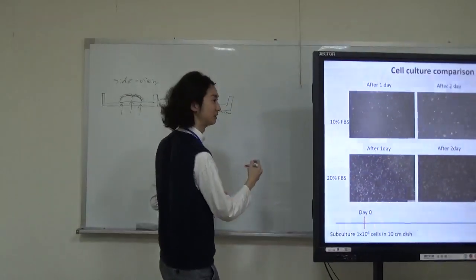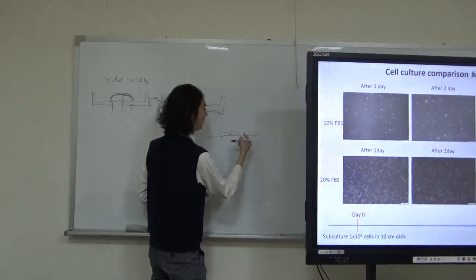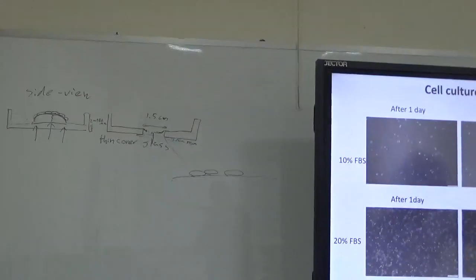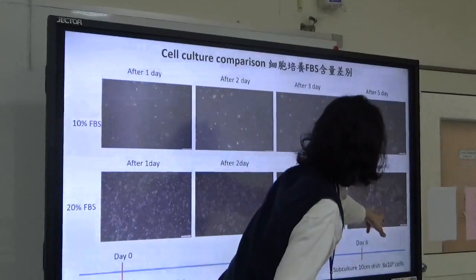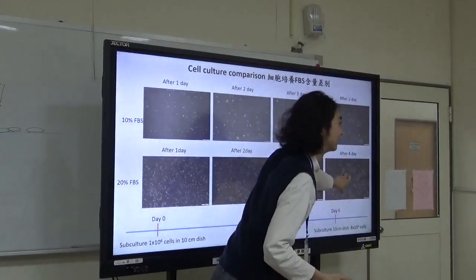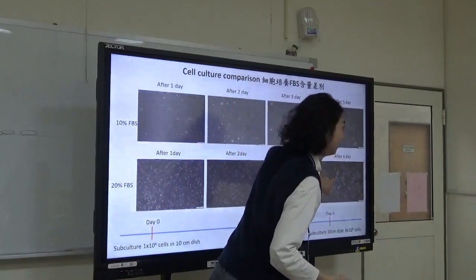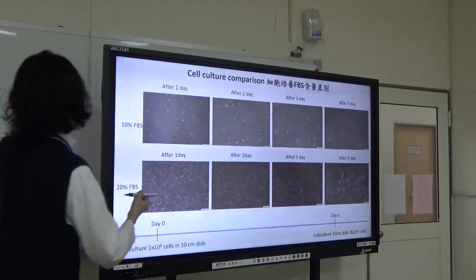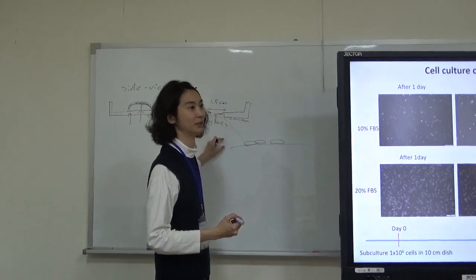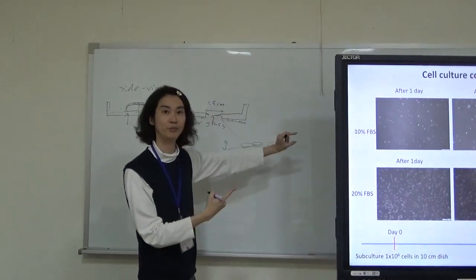In the proliferation stage, Caco2 cells cultured show a simple cell shape. Of course, we can see the simple structure like epithelial cells, but with many different types, like round shape or tiny cells. But this shows the height of the cells is low.